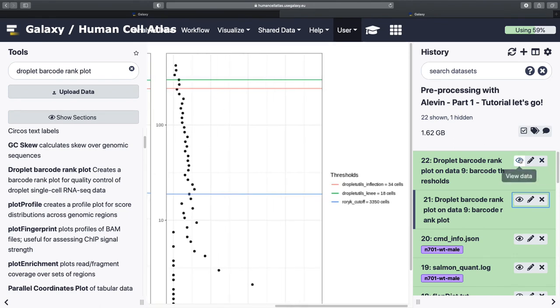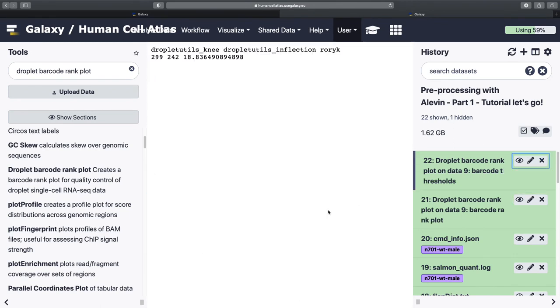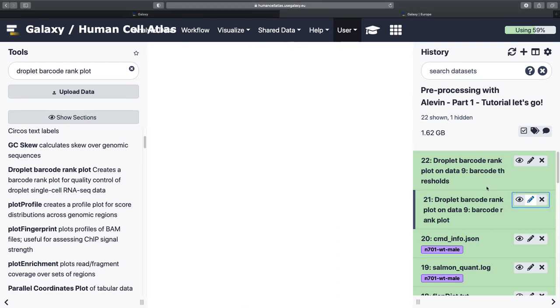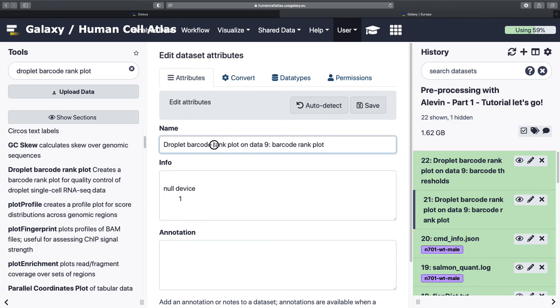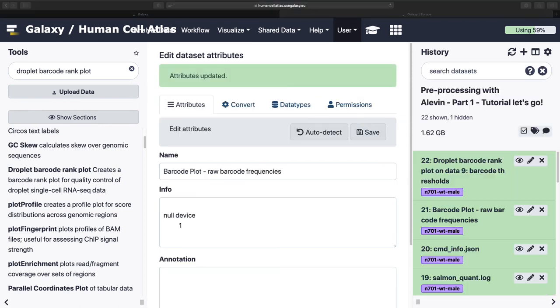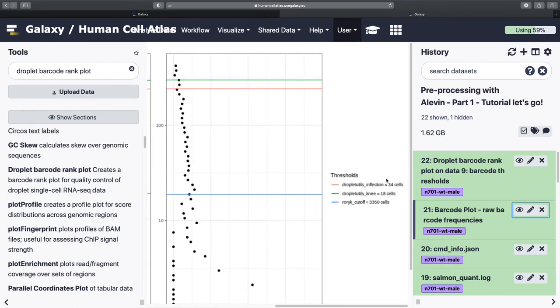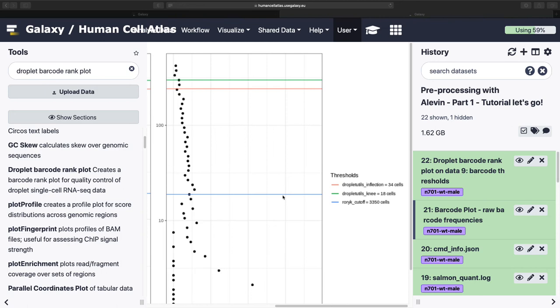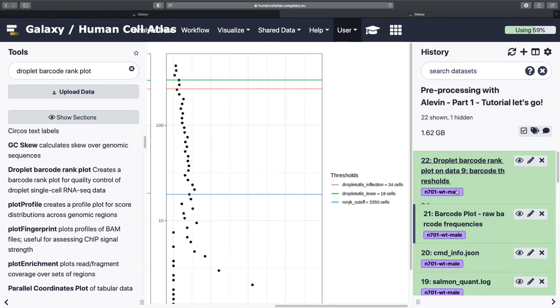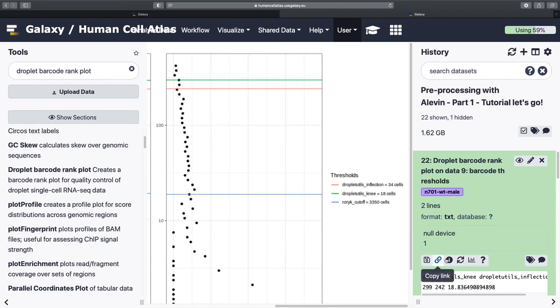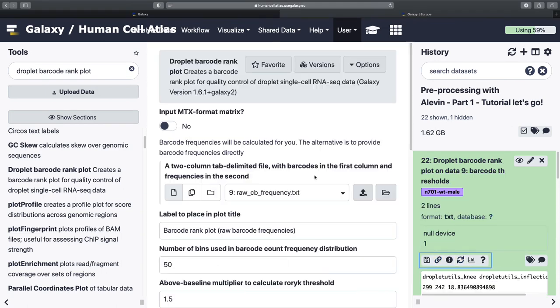And then we can look at thresholds it gives us. Cool. And I'm going to be good. And I'm going to rename my plot. And then, this is, I'm going to be honest, these numbers are poor. So hopefully it's giving you images because this is downsampled data. So yeah, there's a reason it looks rough. Although to be fair, it would be kind of rough anyway. So let's redo this. Let's redo this jazz.